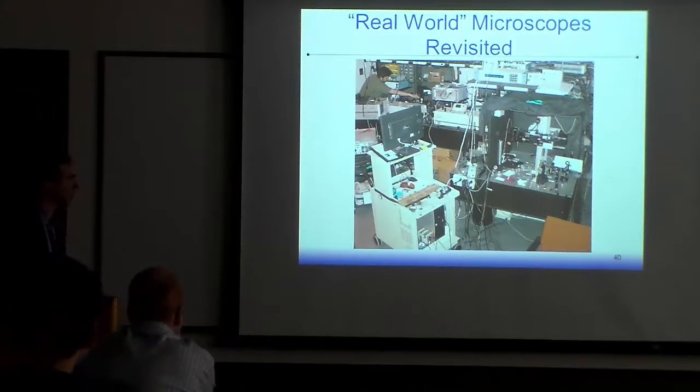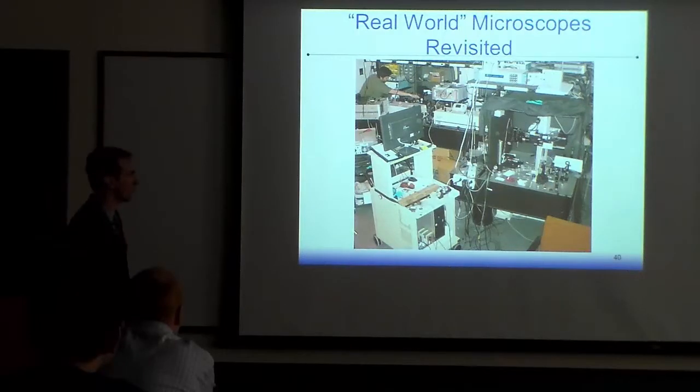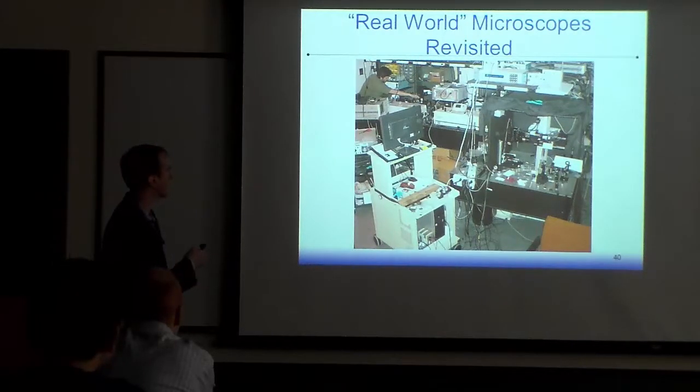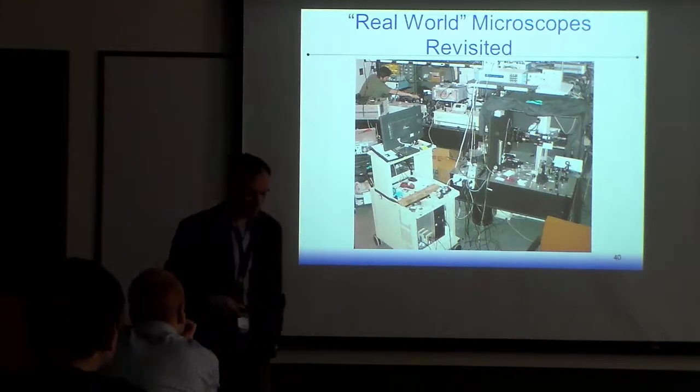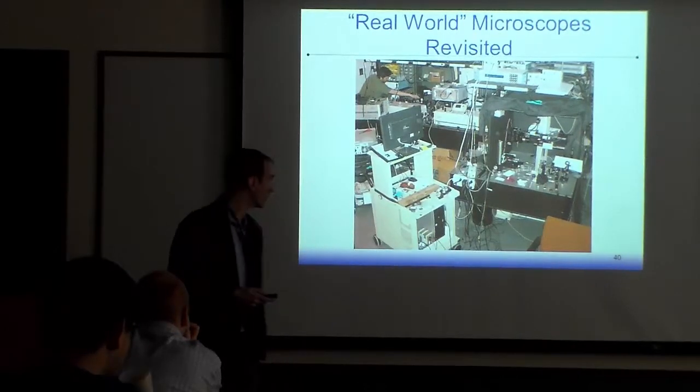Okay, so if you're looking at an experimental microscope, nice clean Nikon. This is really what our labs look like. You got a PhD student sitting back there. You got the Ti sapphire laser and maybe an OPO if you're going for long wavelength. You got the microscope over here and the computer controlling it. And really, we're trying to figure out ways to make this more accessible, especially in medical offices, for doctors. What can you do with this?